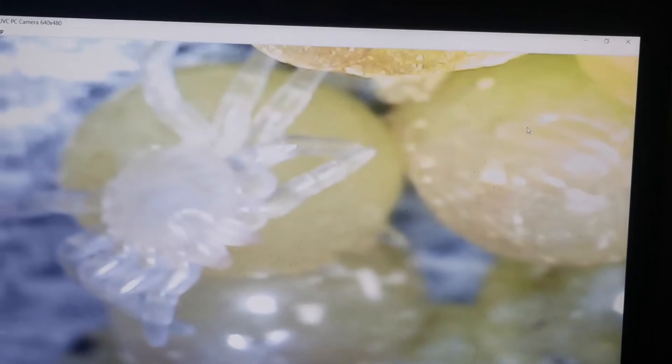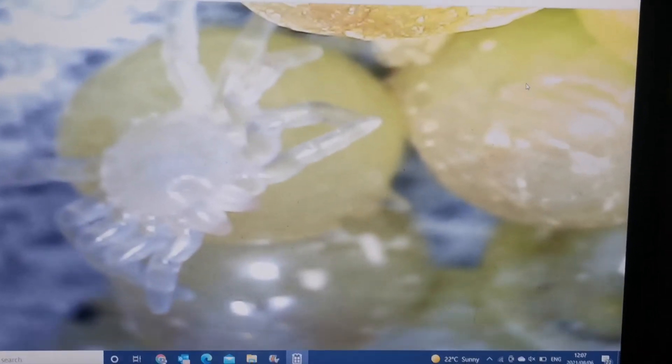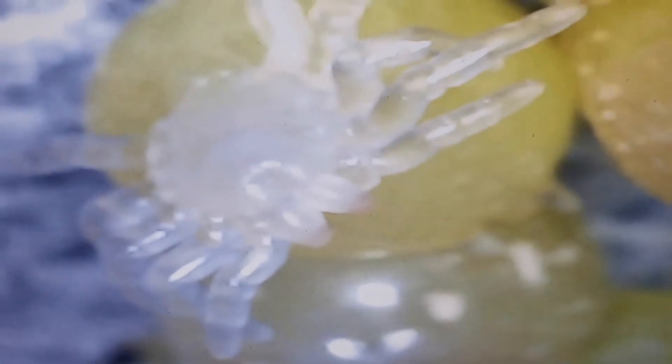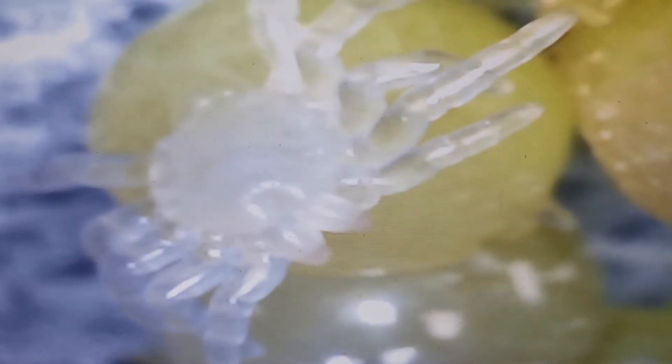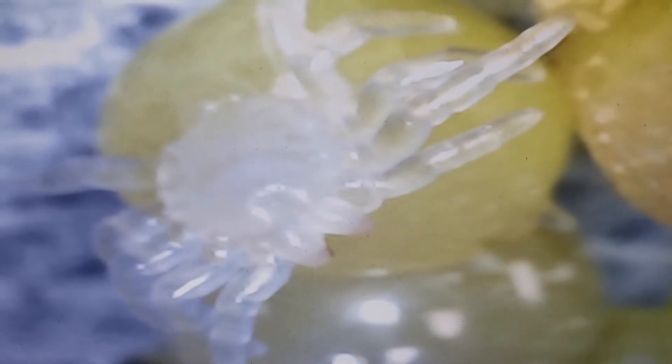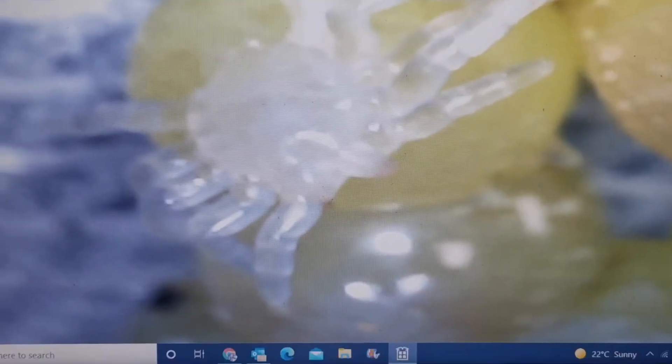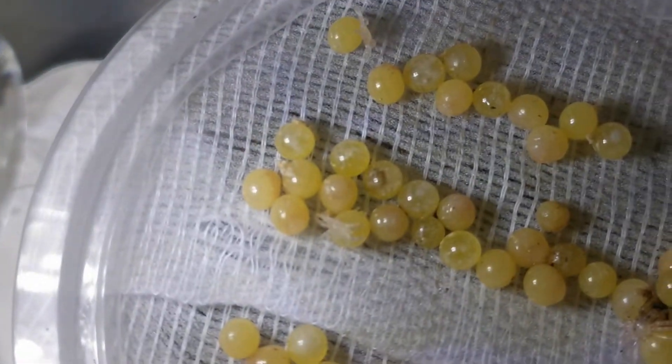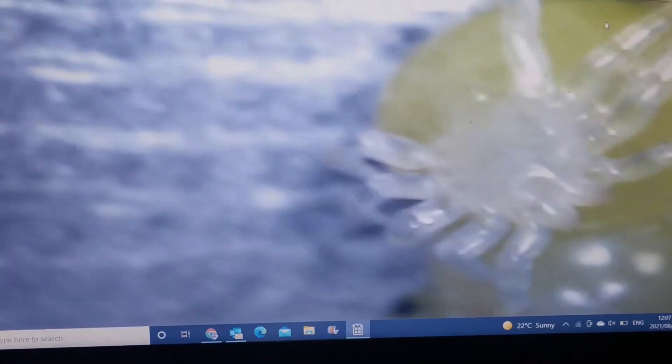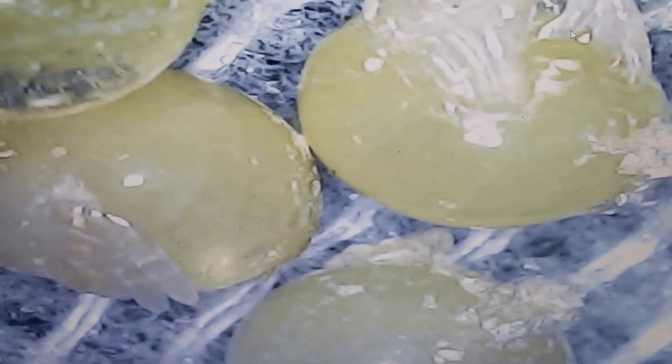Okay, it seems I got it exactly where I wanted it. There's a little tarantula baby. I call them ticks, they look like ticks. Now it's one that's moving there. Right there, those stripes, those are the legs of the spider that will develop and come out eventually.